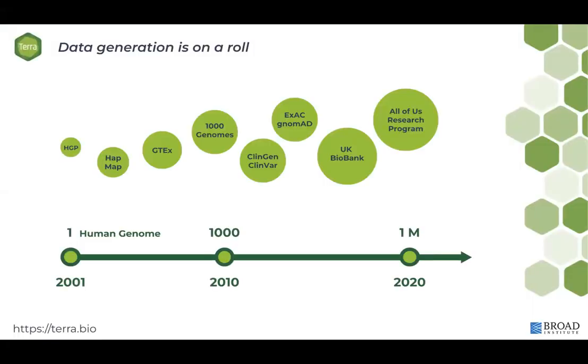Well, first of all, let's talk a little bit about the background, the lay of the land, how we got here. If you're trying to unlock the mysteries of human genetics today, there's a lot of data to work with, as everyone here indicated with their answers. Vast amounts of genomic data, as well as phenotypic data and medical records. Governments and other institutions have invested millions of dollars in generating data sets.